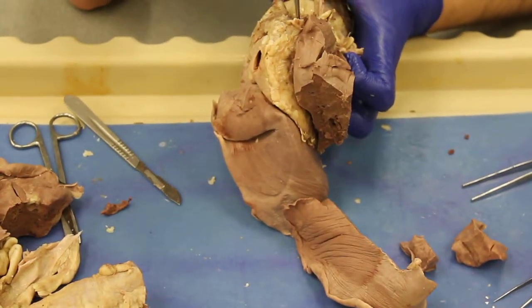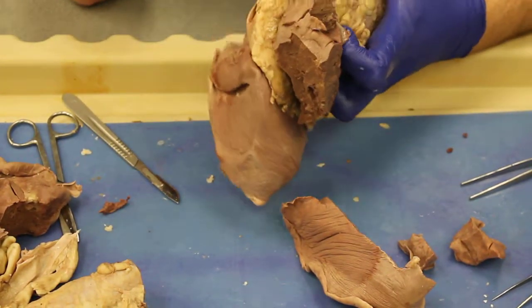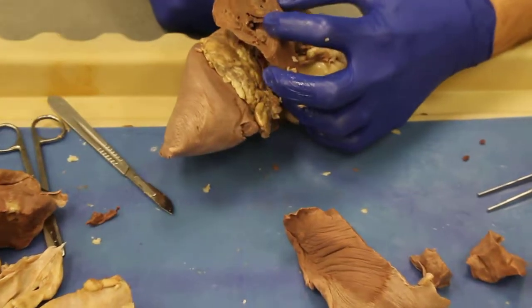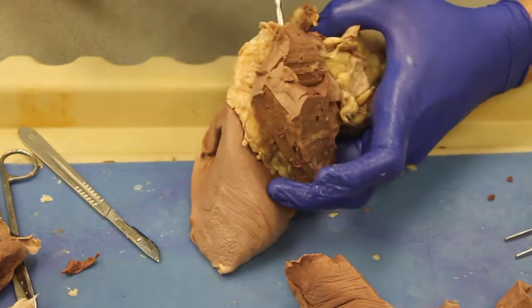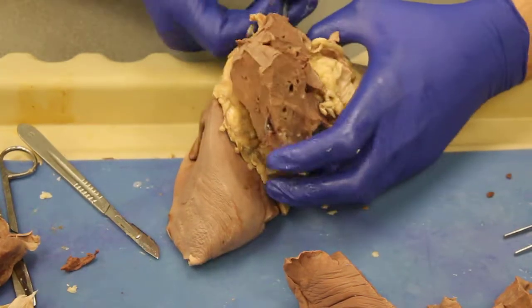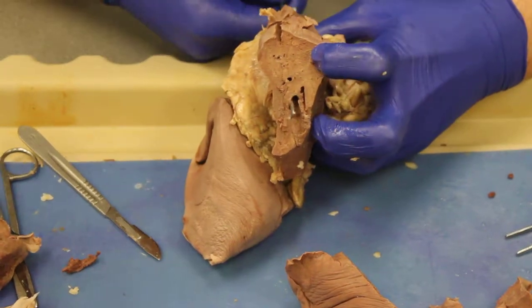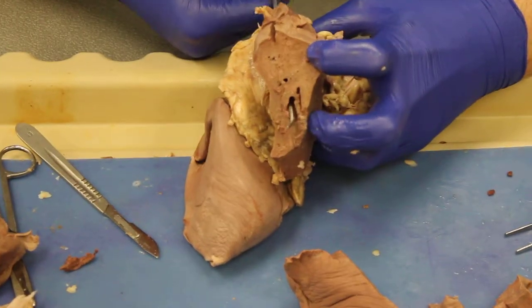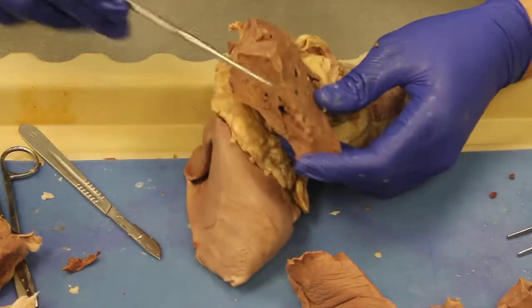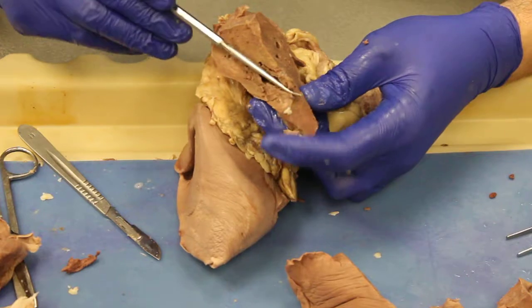the right main bronchus, as I showed you before, and then continue past the right main bronchus and out into the opening. So now this is the continuation of the right main bronchus, and this is the continuation into a branching point of the secondary bronchi here and here.